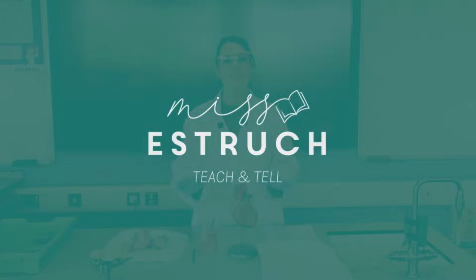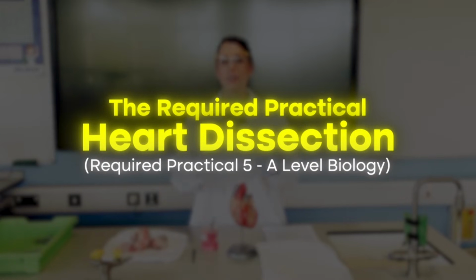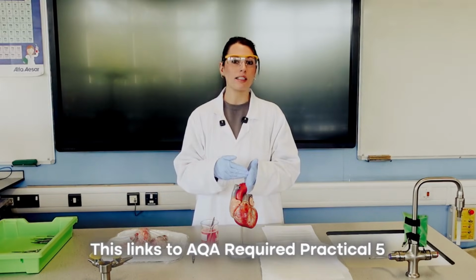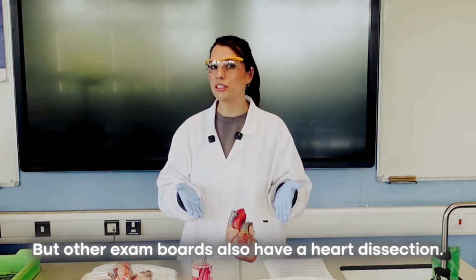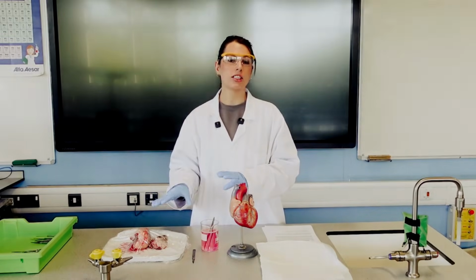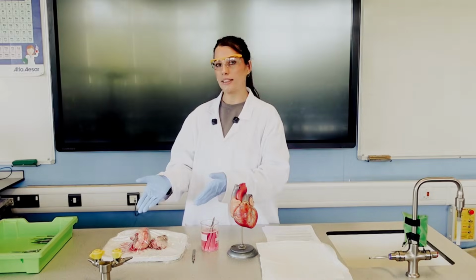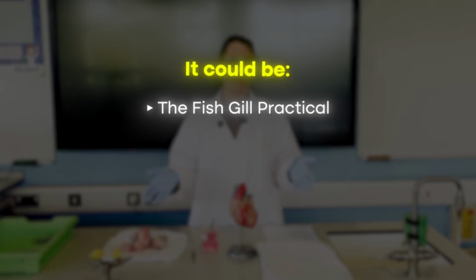Welcome back to another video going through the required practicals for A-Level Biology, and in this one we are doing a heart dissection. This links to AQA required practical 5, but other exam boards also have a heart dissection. You don't actually have to do a heart dissection for the required practical. It's any organ that is linked to mass transport or gas exchange for plants or animals. So I'm doing a heart dissection. It could be the fish gill practical instead, it could be lungs, or you could use plants.